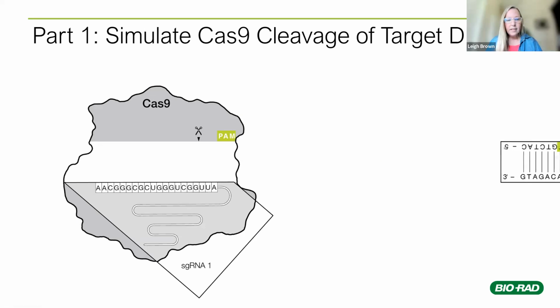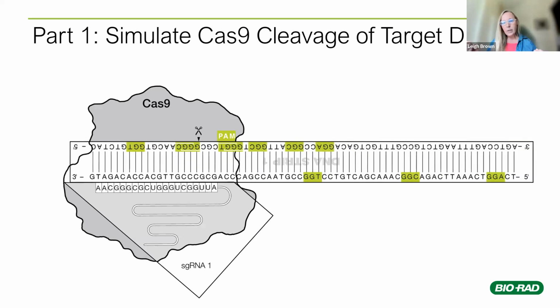Okay. So the next thing is you're going to take one of those pieces of DNA. We're starting with DNA strip 1, and you'll note that the letters, the top half is upside down, right? We've actually flipped this whole strip upside down in this case. It's just so your students can more easily match the DNA so they can read it a little bit easier. So that's the only reason it's like that. Of course, Cas9 will scan both ways on this strip of DNA, on this region of DNA. And every time it encounters a PAM site, we can stop there and look and see if we have a match with our guiding region on the single guide RNA. So let's go ahead and do that here.